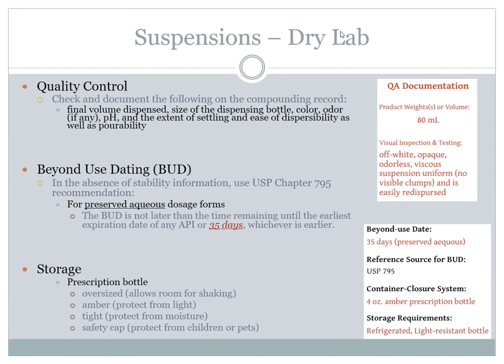Now smell it. It does have a smell. When you do your suspension out there, it's not a strong smell, but I would argue you can smell something. For this one though, we took a big whiff and we didn't smell anything. So we're going to call it odorless. Okay. So we have an off-white, opaque, odorless. And then lastly, we want to describe the consistency of the liquid as viscous. Remember, we wanted it to be viscous. That's why we had the suspending agent.